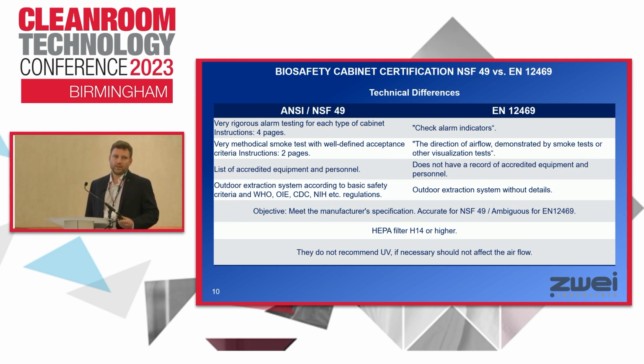To remember, the Laboratory Biosafety Manual of the WHO, the World Health Organization, says that we need a canopy connection to extract the air to outdoors.